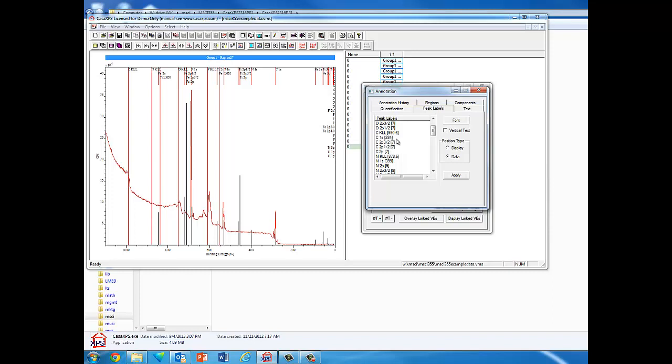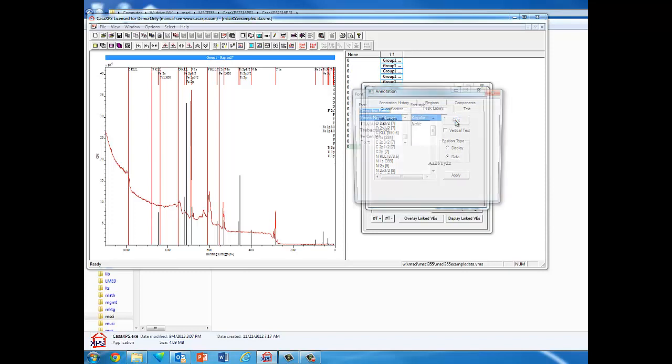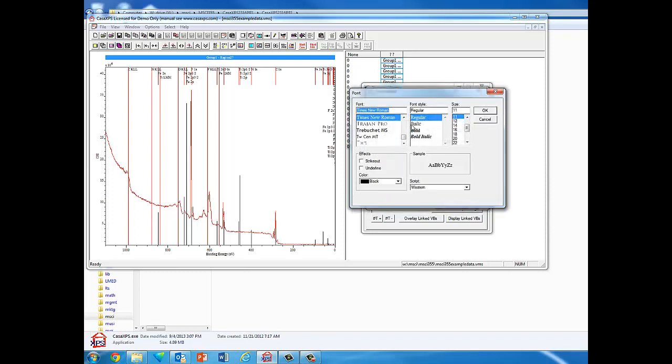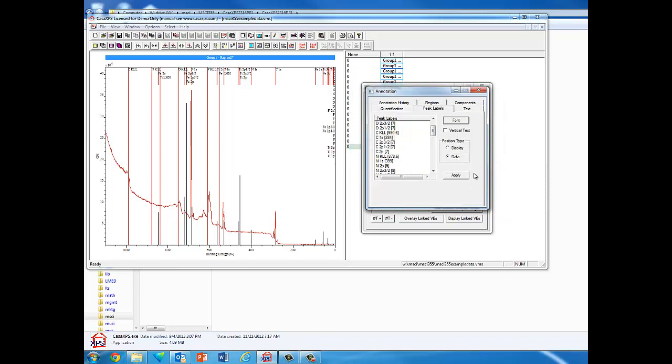For example, if we want to label the carbon 1s at 284 electron volts, we select that. We can either have it written vertically or horizontally. If the checkbox here is checked, I'll do it horizontally. We can change the font size to anything we want, and also change the font style. Let me make it a little bigger, we'll choose 14 for the font size, and when I hit Apply it actually labels the peak. Instead of having to use the labels up here, it will label this the carbon 1s.